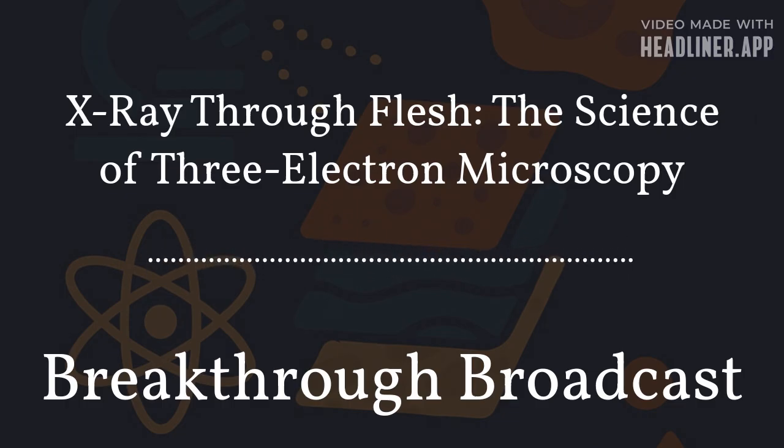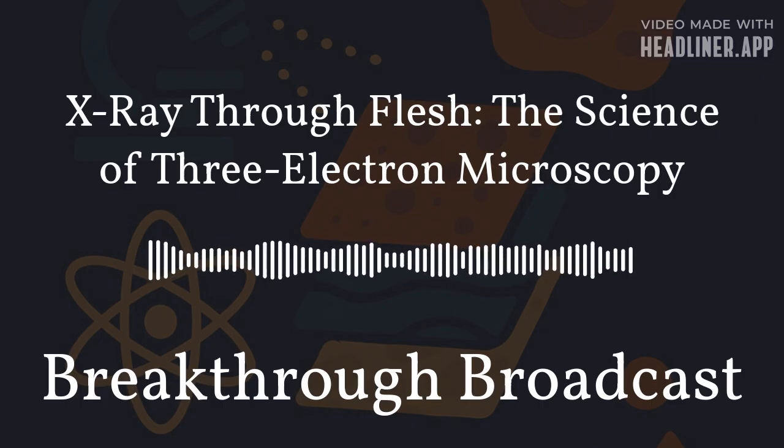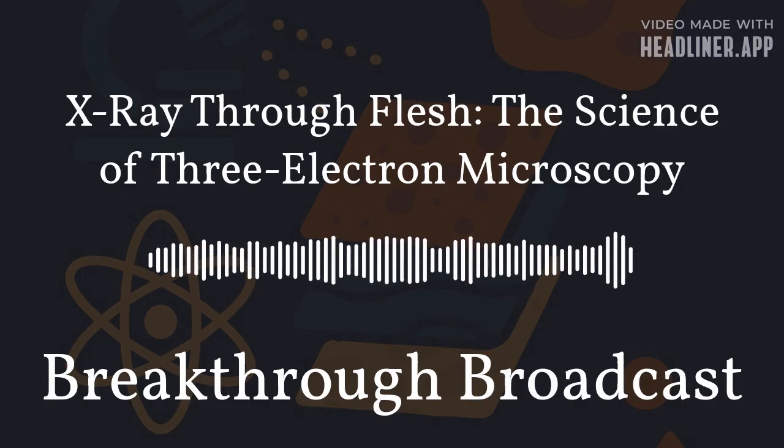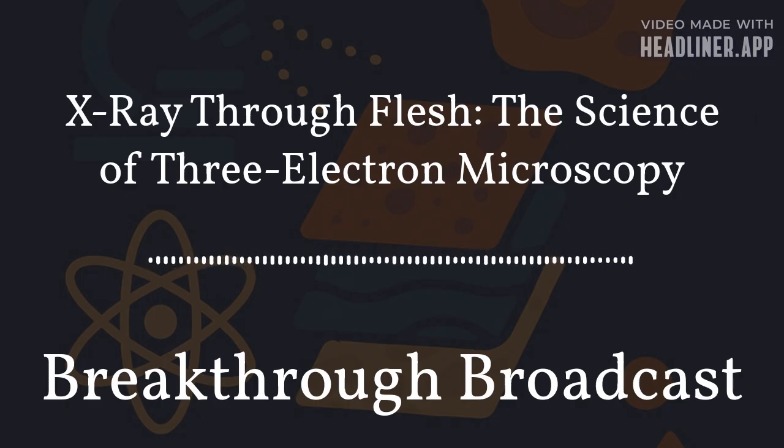To understand why this matters, imagine examining a thin human slice of tissue under a traditional microscope. Even with careful preparation and high magnification, certain structures blur together. Layers overlap, tiny membranes hide behind denser material, and deeper features disappear entirely. Scientists have always been able to see parts of the picture, but those parts often lacked context. Three-electron microscopy was designed to solve this. By capturing three completely different electron signals, it reveals surface features, internal organization, and compositional differences simultaneously, turning what used to be fragments of information into a continuous, interpretable picture.